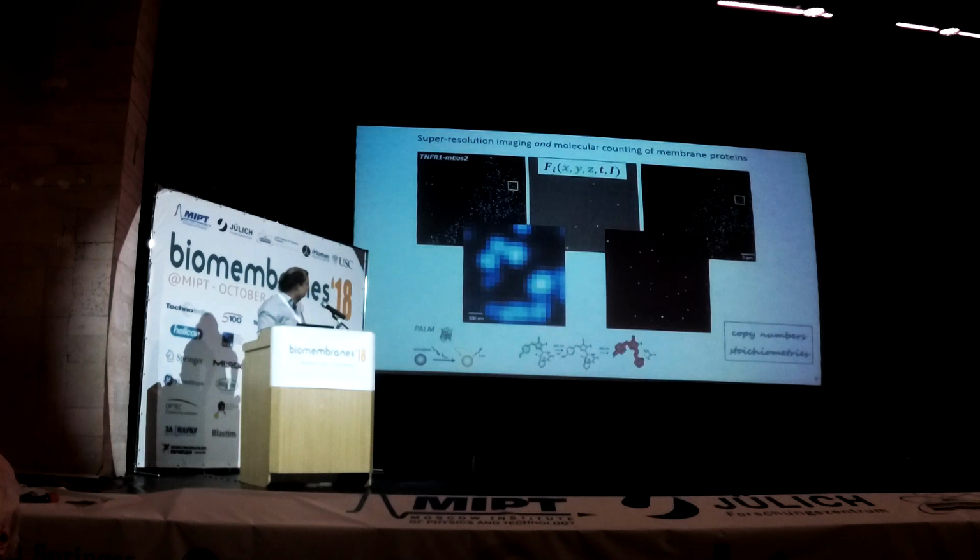Let's look inside. This is the conventional image, and this is the super resolved one. So we can see these clusters, these protein clusters. We don't have the resolution to decide whether this is a monomeric or a dimeric protein. But not all is lost.